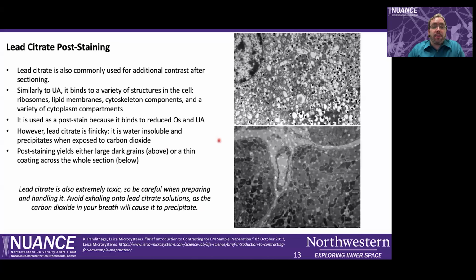So it's pretty water insoluble, and if you exhale on it, the carbon dioxide in your breath will cause it to precipitate. So you do have to be fairly careful in handling it. It's also extremely toxic, so you have to wear gloves and all of the various other things that you have to do with all these other metal stains we're using.